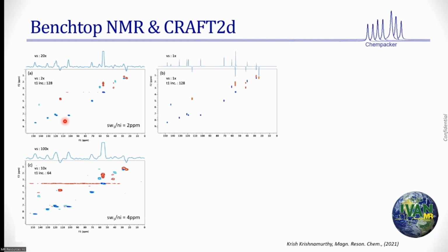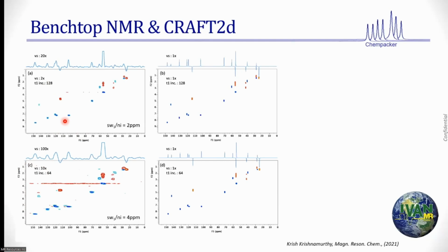Whereas when you analyze this in the tabular domain, those are the 2 spectra. The projection here on the very top is not a high resolution spectrum. It is an actual projection of that 2D representation. So the resolution here, the positive and the negative peak resolution, they are all real. I just projected it. It's a skyline projection. It's not even skyline, it's a sum projection.